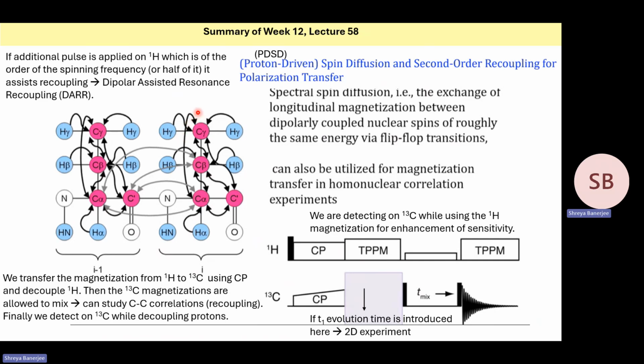Similar to TOCSY or NOESY, like TOCSY, we can find the connectivities within the same amino acid, or with the adjacent amino acid, like in HSQC, or with even longer distance amino acids, like in NOESY. So this mixing time we are additionally adding is recoupling what we had previously decoupled. And then after this, we can collect the FID.